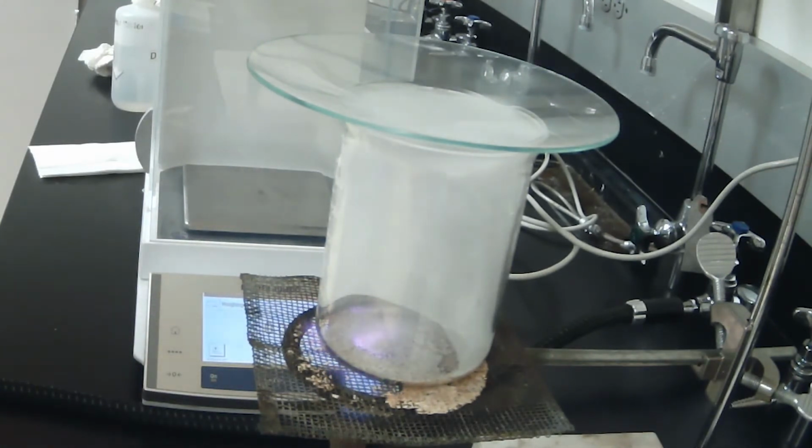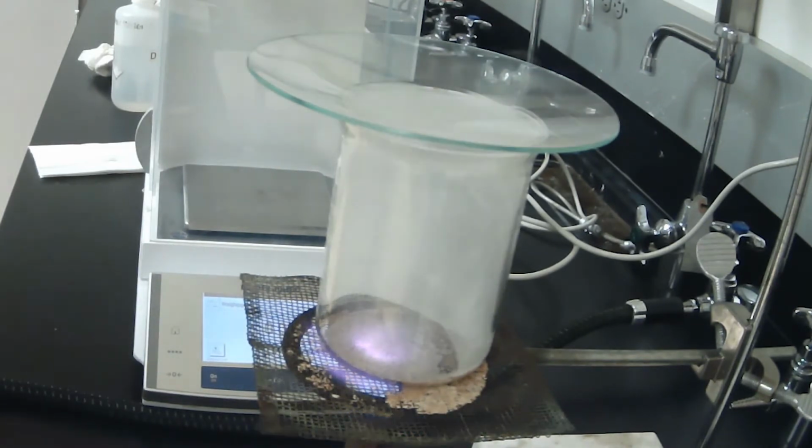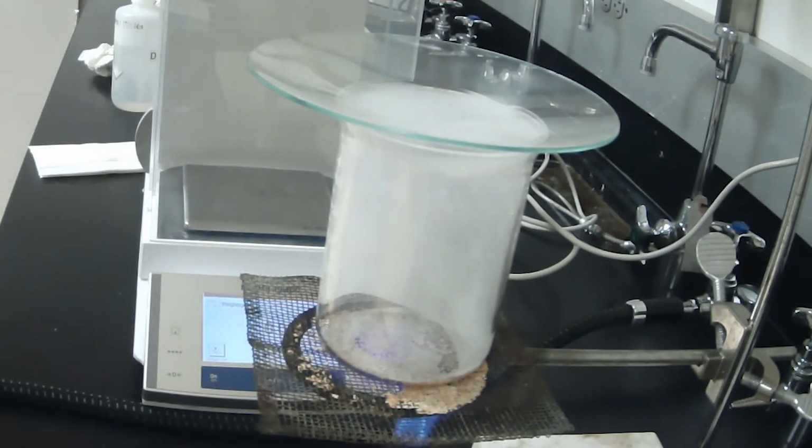Backside. Right now, on the sides away from the camera, we have about a 1 centimeter gap. I like it to be closer to 1 inch before we go to the next stage of this experiment.